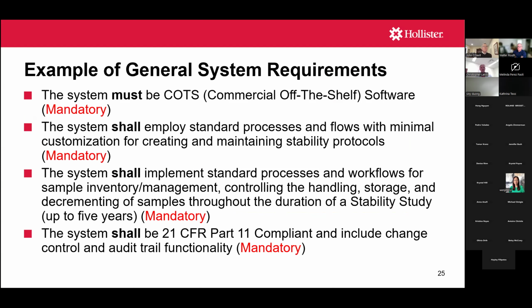So let's go through a couple examples. So again, this was in the category of general requirements. It was mandatory for us that whatever we selected was what they call COTS, commercial off-the-shelf software. So we didn't want some customized solution. Mandatory, of course, 21 CFR Part 11 compliant. So these are things that we had for our general system requirements.